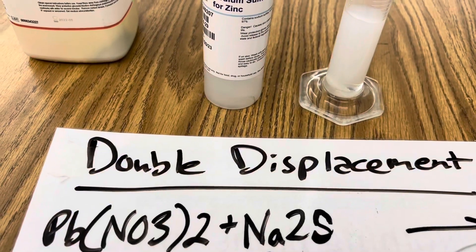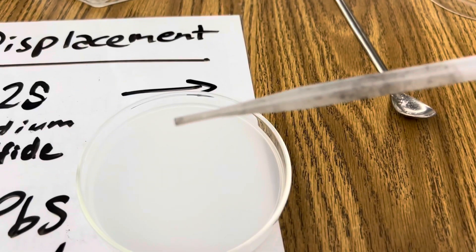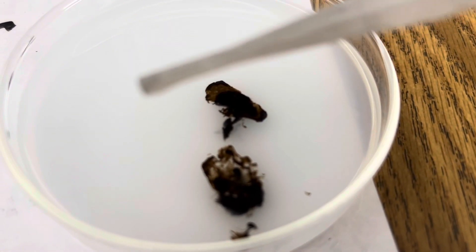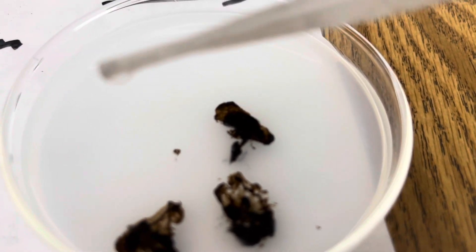Just a drop of this — I'm going to come over here and just put a drop on my lead nitrate. Watch what happens immediately. Look at that dark black precipitant the minute I combine the two. There's a clear drop.